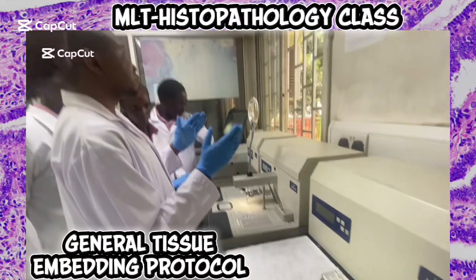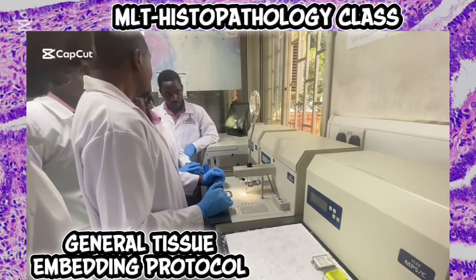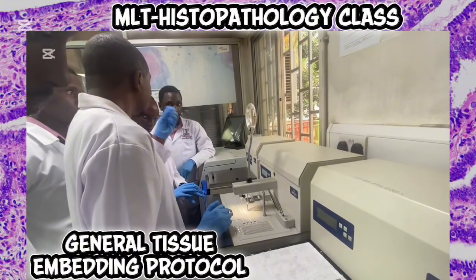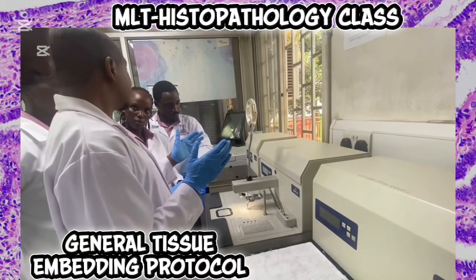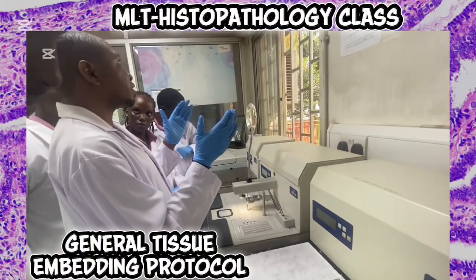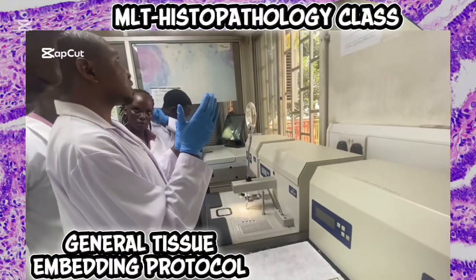Tissue embedding, blocking, or casting. Tissue embedding involves surrounding a processed tissue with a much stronger media that will give it support during microtomy. In other words, in the whole process, the tissue is surrounded with a molten medium with the help of a tissue mold. Subsequently, this medium is solidified to make a tissue block for cutting thin sections of tissue. Therefore, the major aim of tissue embedding is formation of a tissue block.